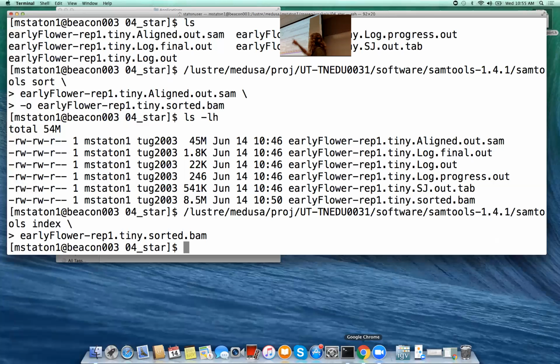This is our itty bitty sample at the top. This is a much bigger sample. So hopefully if you take that itty bitty sample and scroll left and right, you should be able to find some reads. I think there are just so few reads that they're kind of hard to find.